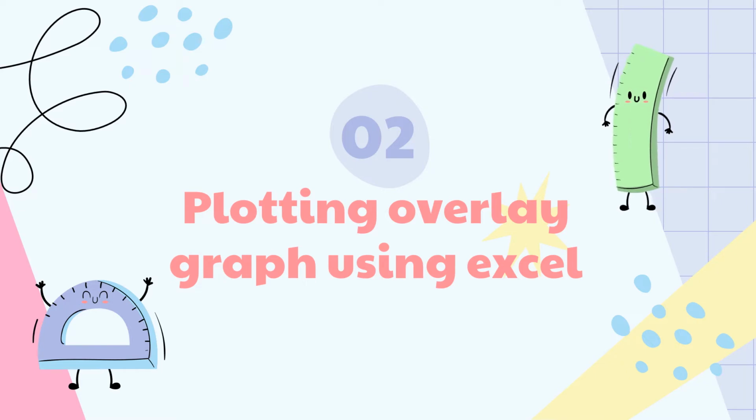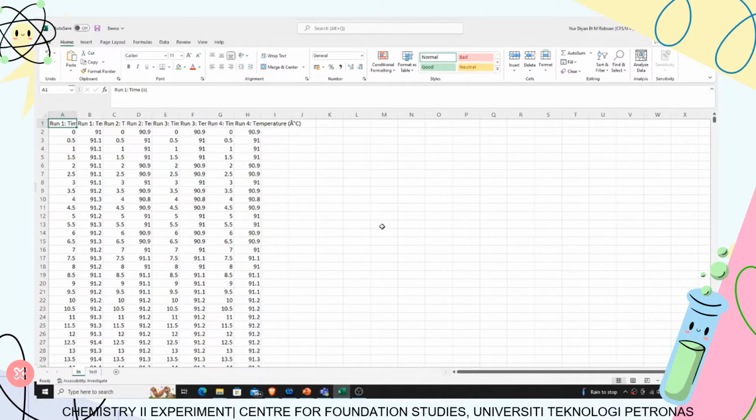So this is not going to be hard. You just need to follow the steps and you are going to find it very easy. Let us have a look. The overlay graph. If you are familiar with the Excel, you may skip this part. Here is the data that we have, a lot. Actually, I have run 1, 2, 3, and 4. But if you do more runs, more repetition, you may have more data.